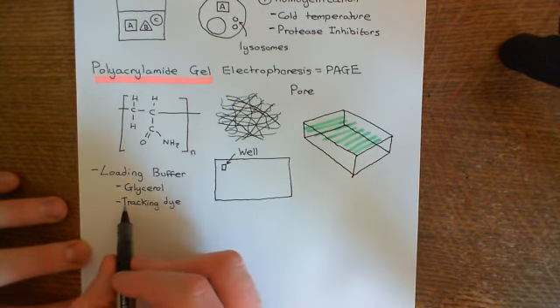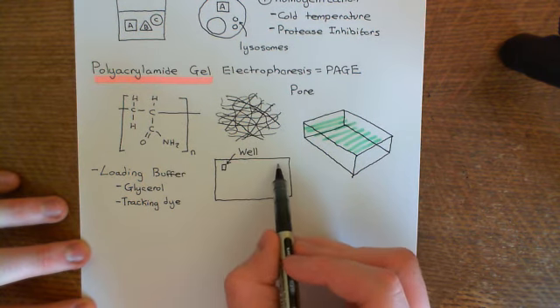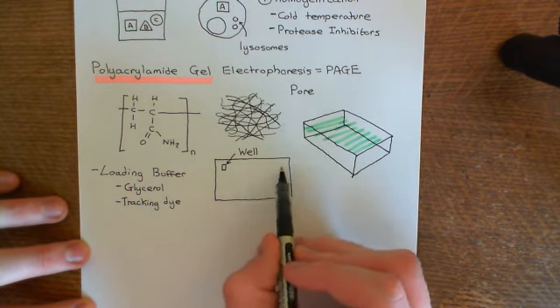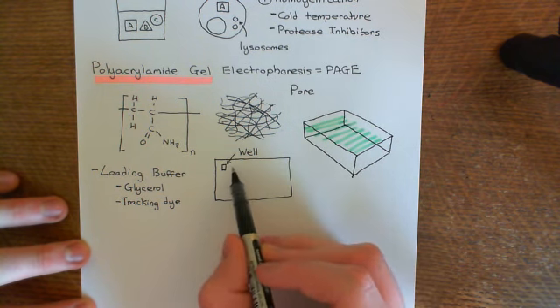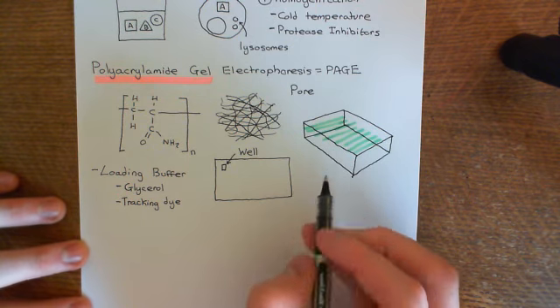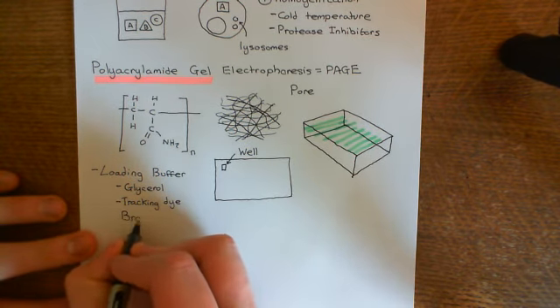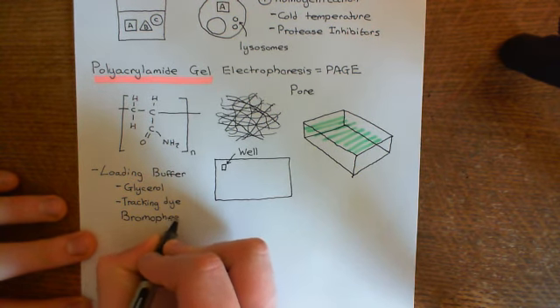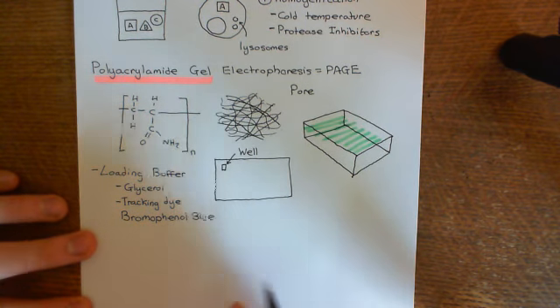Okay, and the tracking dye will move faster than any of the proteins. So, if you've got the tracking dye over here, it means that all the proteins are somewhere further back. So you'll stop the process when the tracking dye gets close to the edge, so that there's no chance that the proteins will have ever got to that edge. And the tracking dye that is generally used is known as bromophenol blue. Okay, right, so those are the two things in the loading buffer.